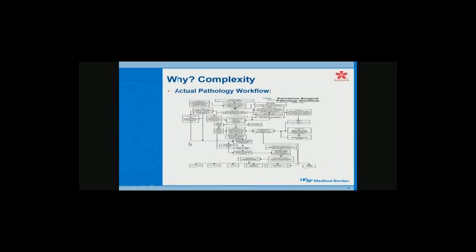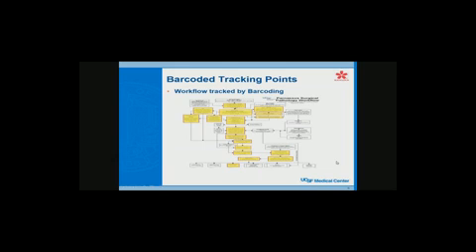The outside impression of histology is that they give us a specimen and we give them a result. And this is pretty much what they think of as this area where it says histology laboratory. To most people, including a lot of pathologists and residents, it is pretty much a black box. They have no idea what goes on in there. All they know is that they get a result out.